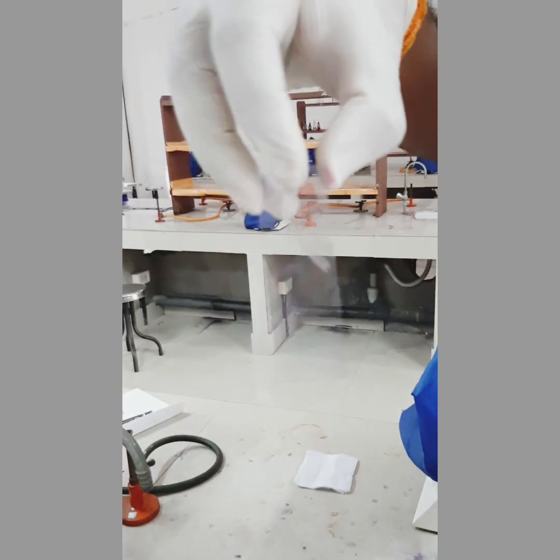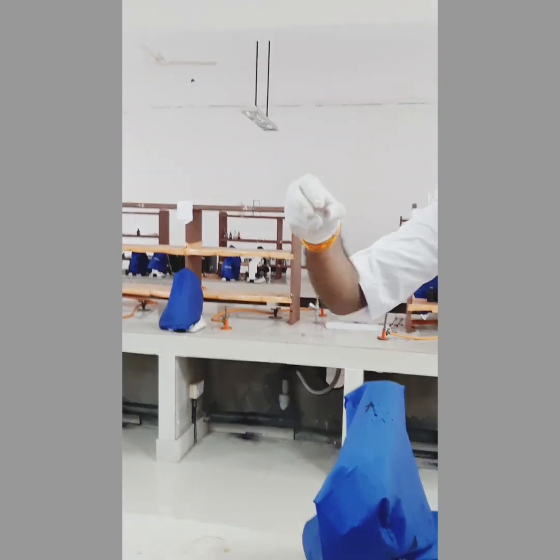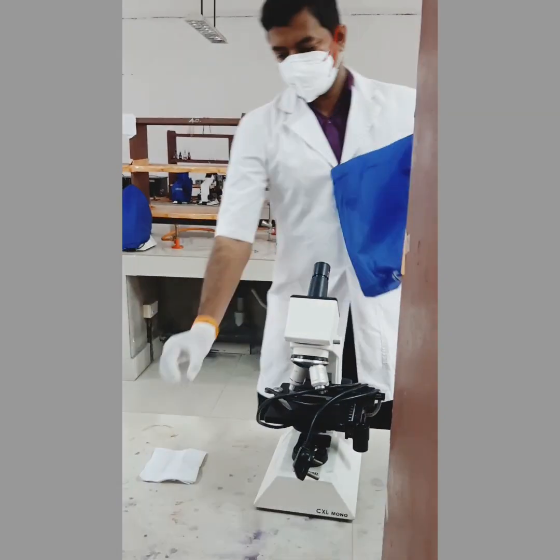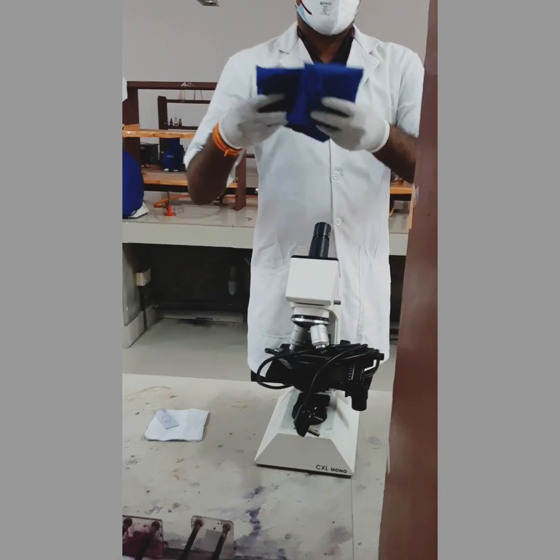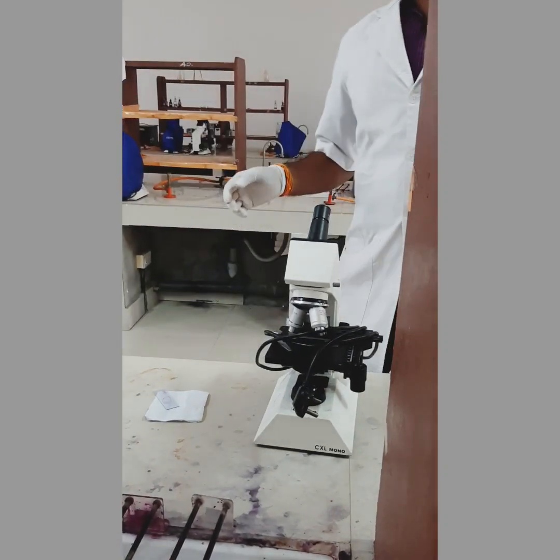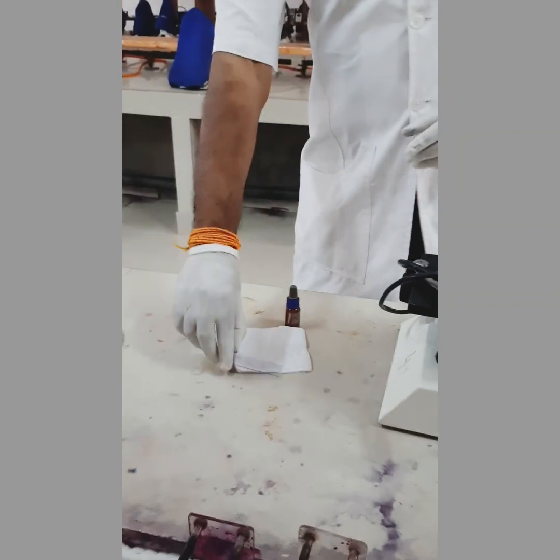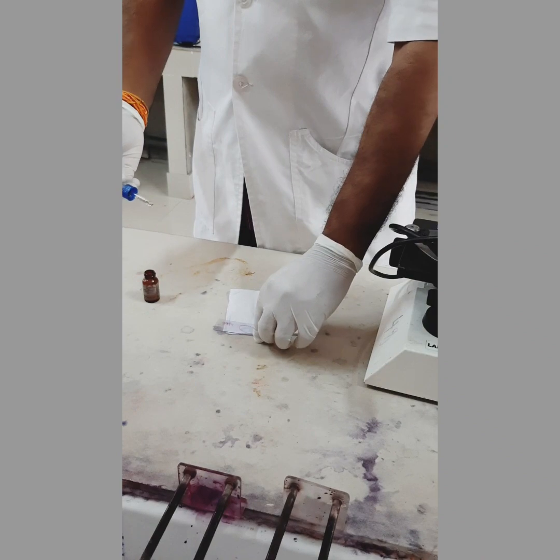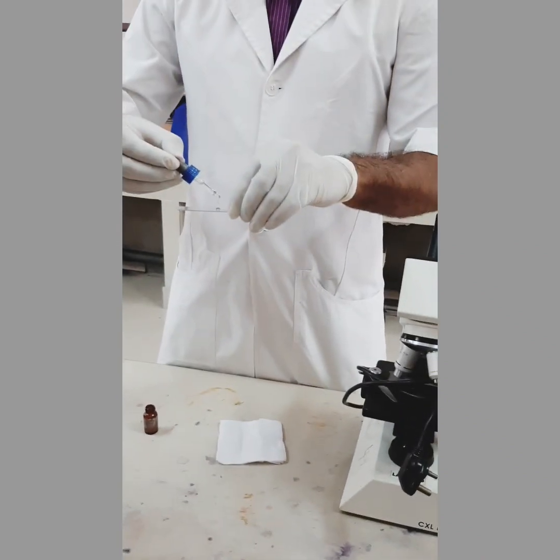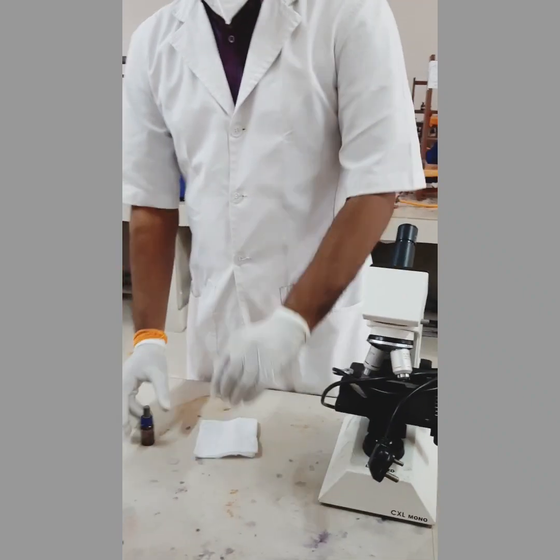Here you can see the dried smear. To focus under the oil immersion objective, you have to pour 1 drop of oil. You must be careful, just add 1 drop of oil over the smear and focus under the oil immersion objective. Otherwise it is difficult to focus.